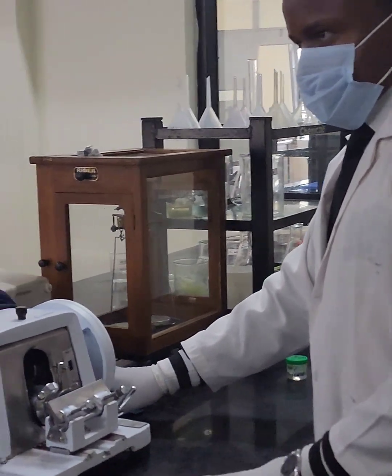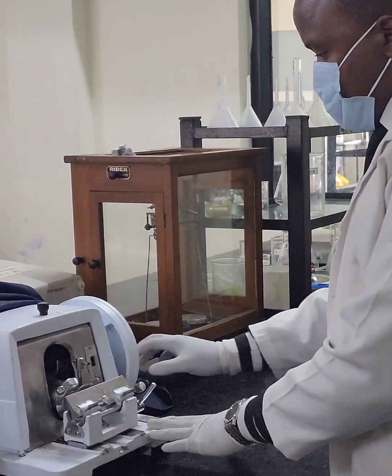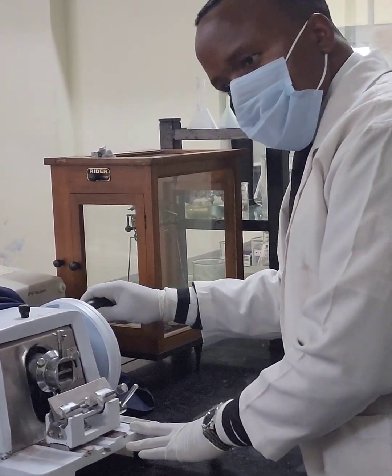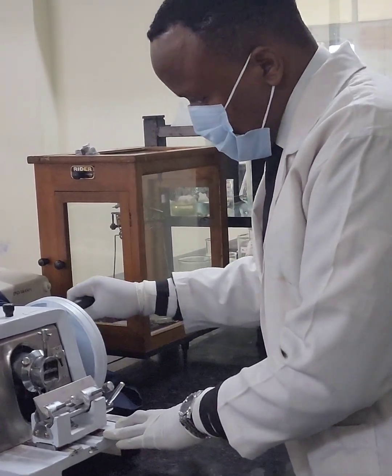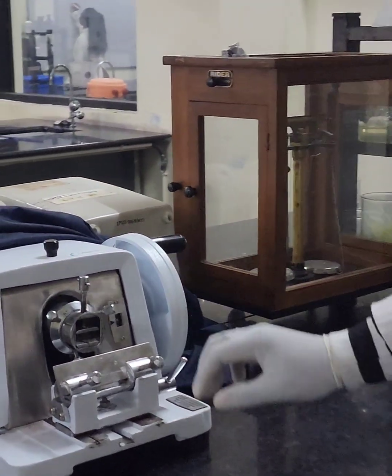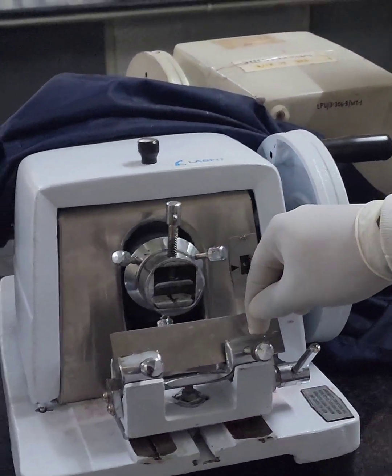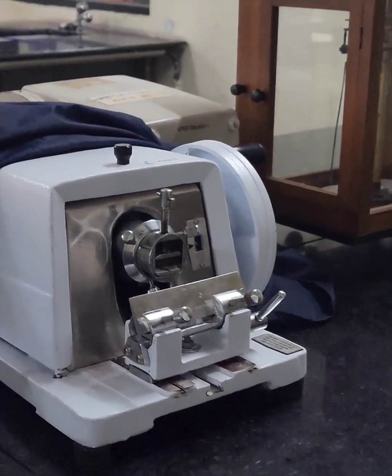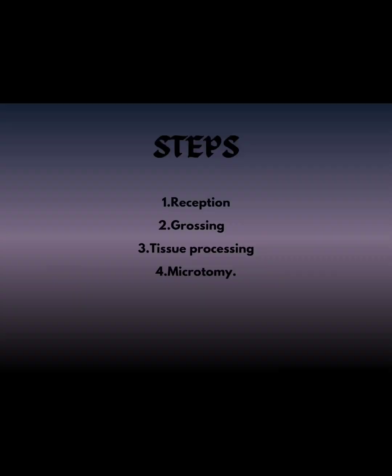As you can see, a rolling up and down motion can be made when we are cutting, and if you look closely you'll see where we put our block prepared from the paraffin wax and where we can put the blade which will be used for cutting. This allows us to have ultra thin sections which can be viewed later on by the histopathologist.